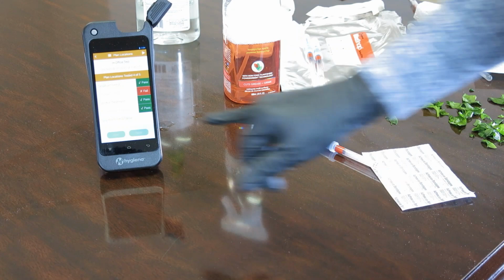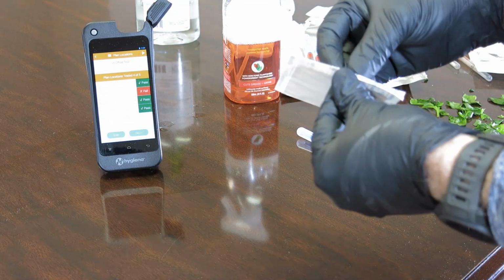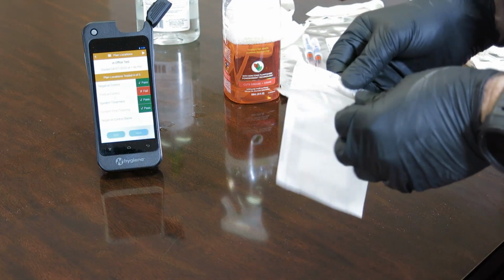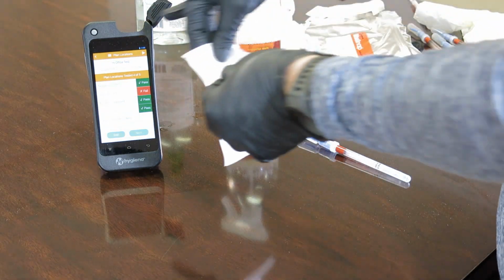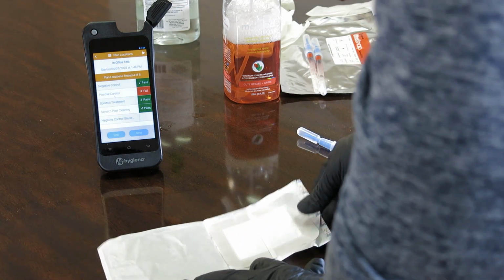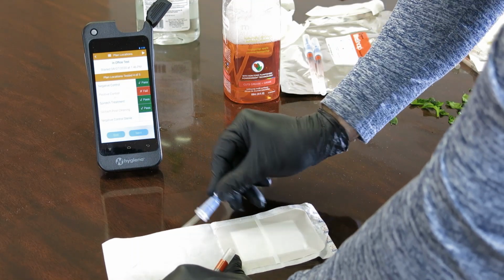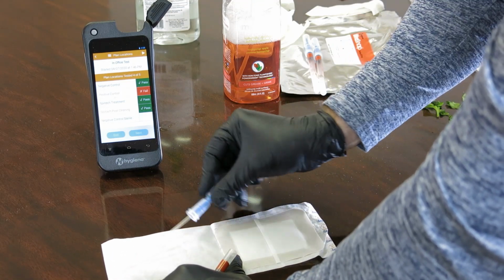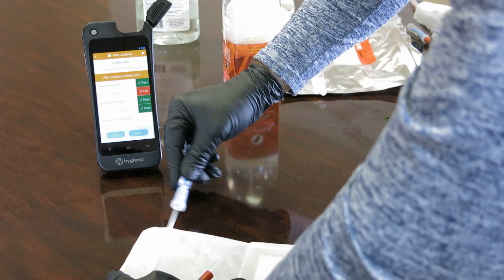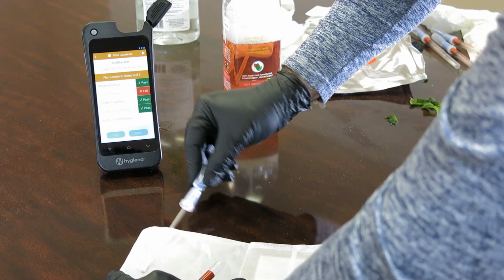Okay, now we're going to do a negative control using the inside of a sterile bandage. I don't think we need to do this very often unless you were just having a hard time getting a clean wipe, just to make sure there's nothing wrong with what you've done. Maybe you've gotten some contaminants in the testing unit or something else that we'll discover happens when we're out in the field. So take your swab. This should be completely sterile. There should be no ATP on this at all. I'm doing it right over the surface that was previously contaminated, so that's probably not good technique, but it's where I have the camera set up.